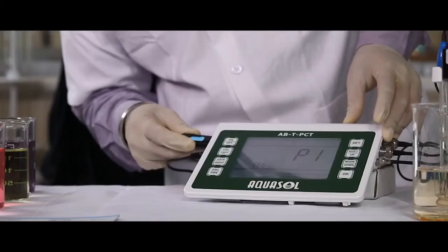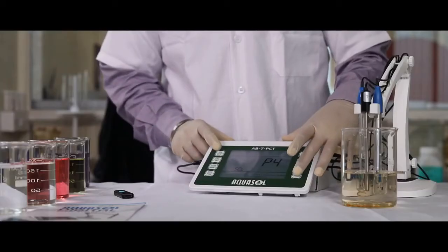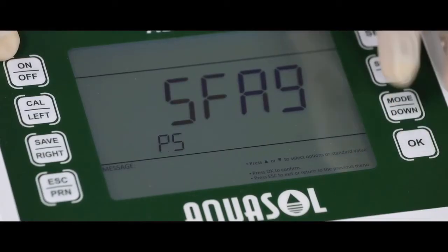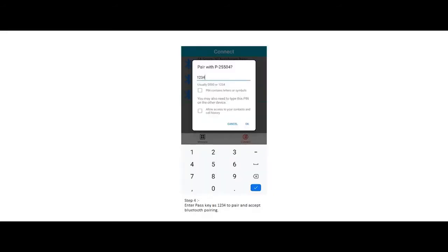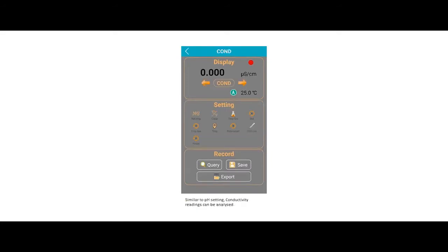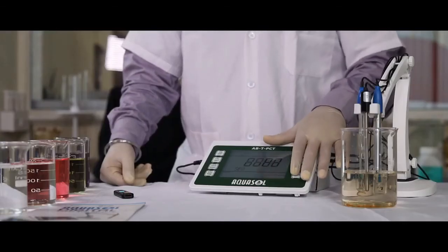P1 to transfer data to a pen drive. P2 to set date and time. P3 to clear all data. P4 to change the unit of temperature. P5 is the meter code. P6 is the authorization code for the Bluetooth app. Press UP and DOWN keys to change values and left and right arrow keys to shift variables. P7 for factory reset.